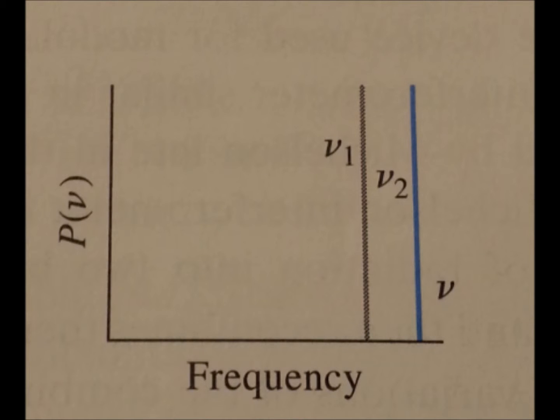Frequency domain spectroscopy relates the incident frequency or inverse wavelength of radiation to the power output. Conversely, time domain spectroscopy, which FTIR spectroscopy operates upon, measures the radiant power as a function of time. For the purposes of this video, only two monochromatic wavelengths of light, oscillating with frequencies nu1 and nu2, will be discussed. When plotted in the frequency domain, meaning that frequency is the x-axis and power is the y-axis, nu1 and nu2 display a characteristic peak at their respective frequencies.